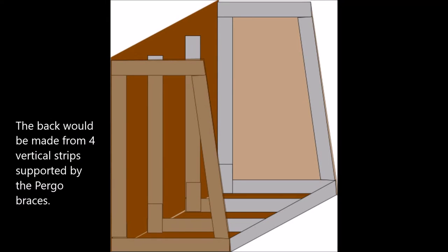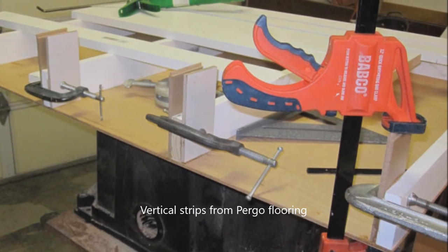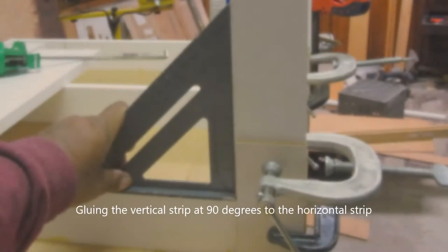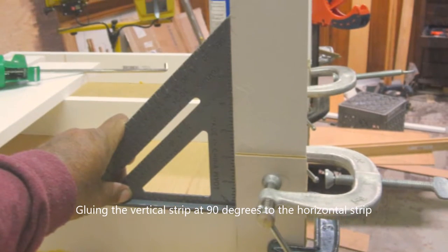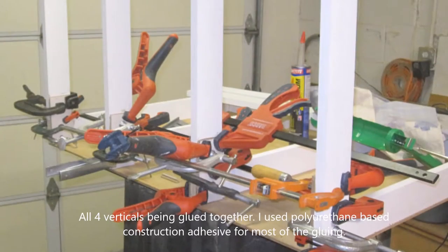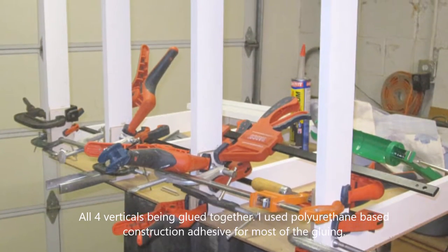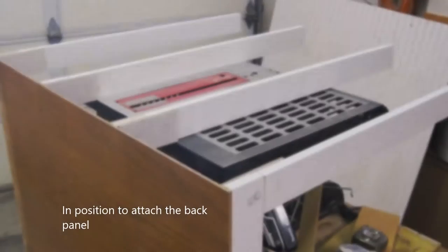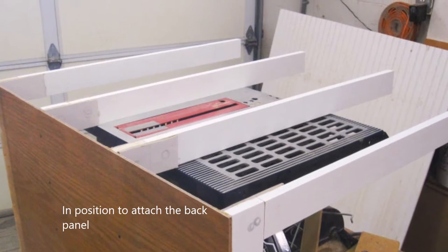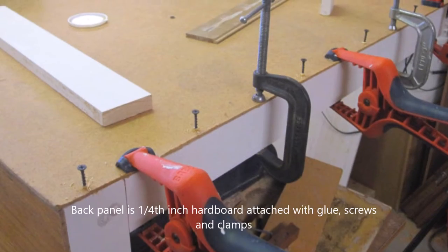The back was essentially vertical strips held by little splints. I glued the splints, which were made out of Pergo flooring — incredibly hard material. Then I attached the vertical risers with construction adhesive. You can see all four vertical risers being attached to the base, all at 90 degrees. Once the glue was cured, I attached a piece of quarter-inch MDF with glue, screws, and clamps.